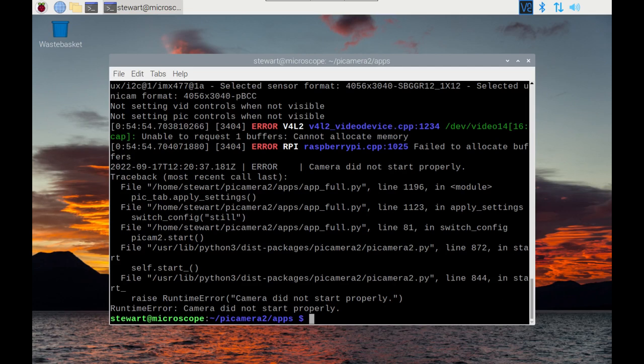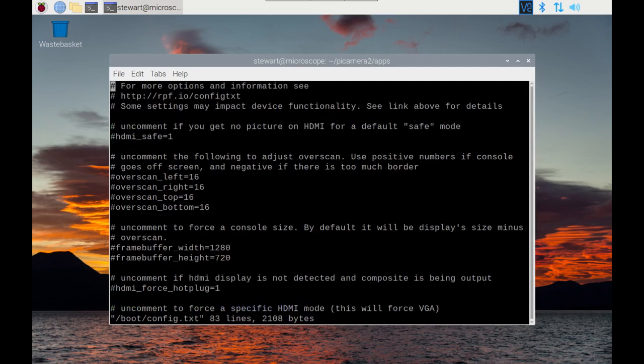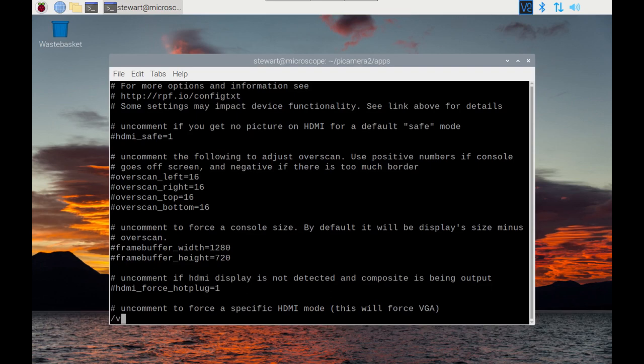To do this we are going to edit the boot.config. I'll use vi, you could use the nano editor if you prefer. So it's /boot/config.txt. And then we're looking for a dt overlay with vc4-kms-v3d, which is the video driver.